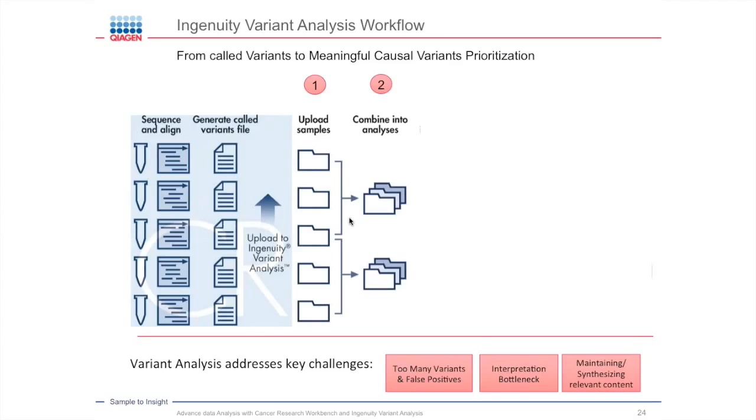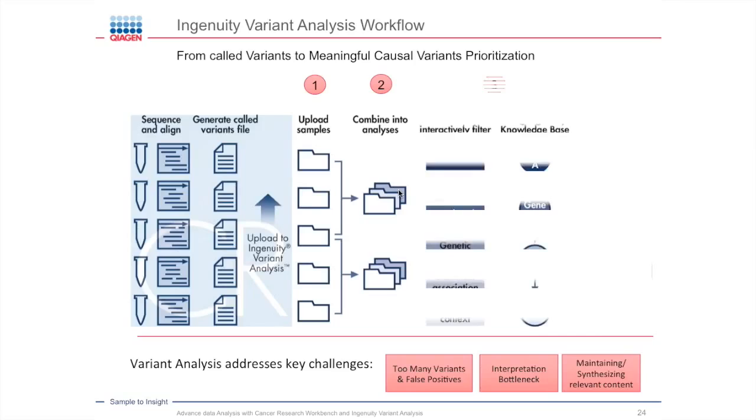Maybe today you have a trio analysis to do. Maybe tomorrow you have to look into 20 different tumor versus 20 different normal tumor-matched samples, as an example. Maybe you're doing a big cohort and you're looking into responder, non-responder, treatment after disease, and which variants may differentiate the responder from the non-responder. So you can combine and mix and match these different samples together to generate an analysis. And there is a really easy to use workflow wizard that will allow you to do that.